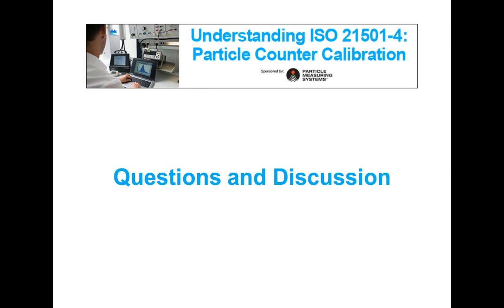And so I recommend to look for something new and updated to accomplish your monitoring activities. Okay, and here's an interesting one. What's the best way to calibrate ambient monitoring stations deployed in the field? Ambient monitoring stations that are used in the field. Of course, you need to refer to a certified, authorized calibration center, but these particle measuring systems also offer service on-site in the field for calibrating your particle counter, to reduce the time necessary and to avoid having your instrument outside of the building for a long time.